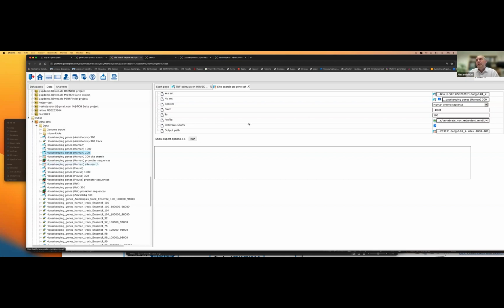All right, so next, we need to specify your promoter length. And we have this from to, which means from TSS upstream, and to means downstream from TSS. Our default is 1,000 nucleotides upstream from TSS and 100 downstream from TSS. Such a region, from experience, is most densely populated by transcription factor binding sites.